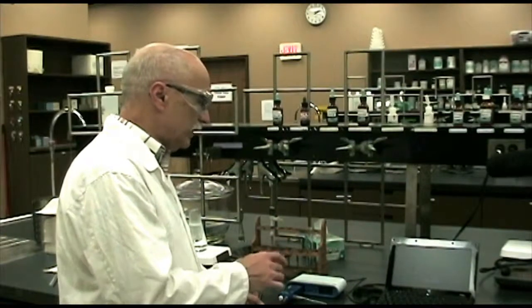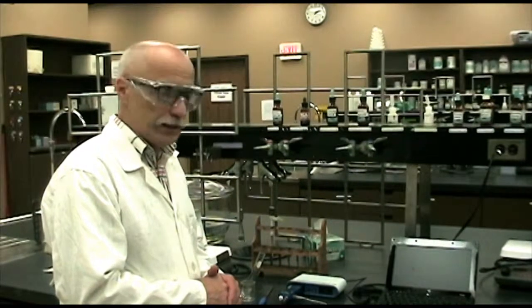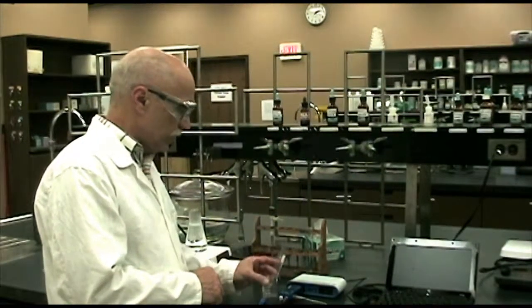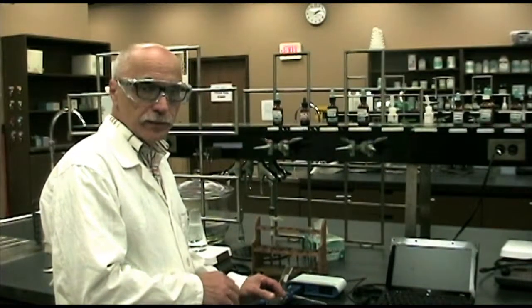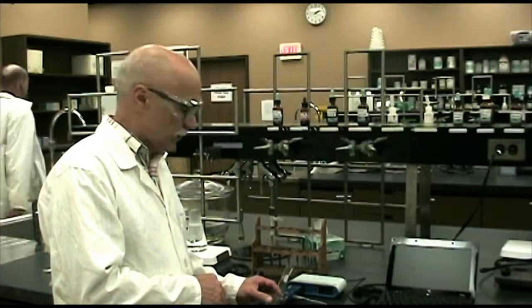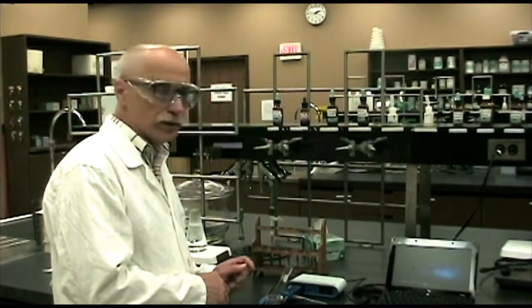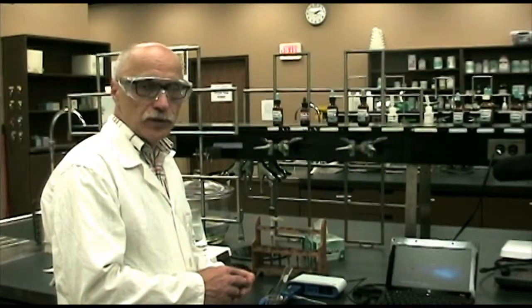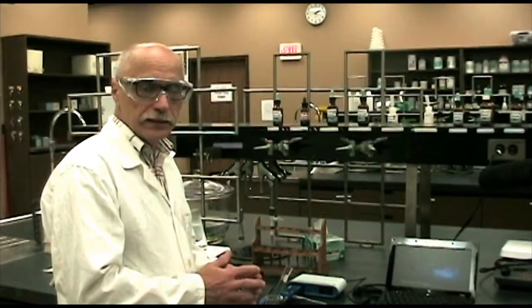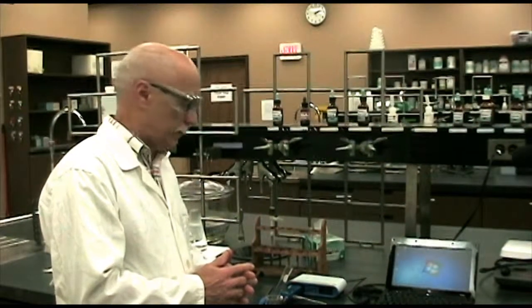So while that computer is loading up, we will weigh the empty test tube and then put lauric acid in it, determine how much lauric acid we have as our solvent, and we will show you how to make the jacket, a thermos-like insulator so that it doesn't cool down too quickly.